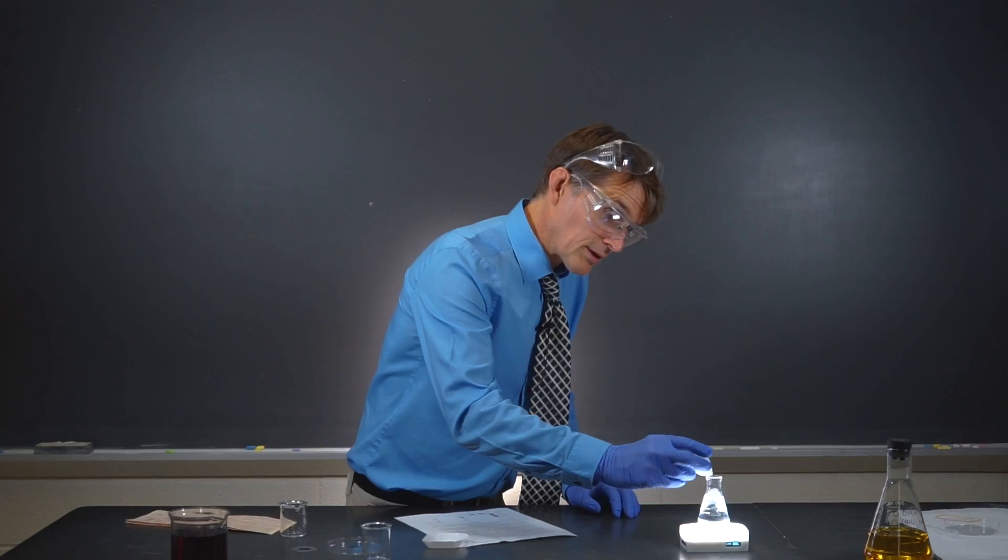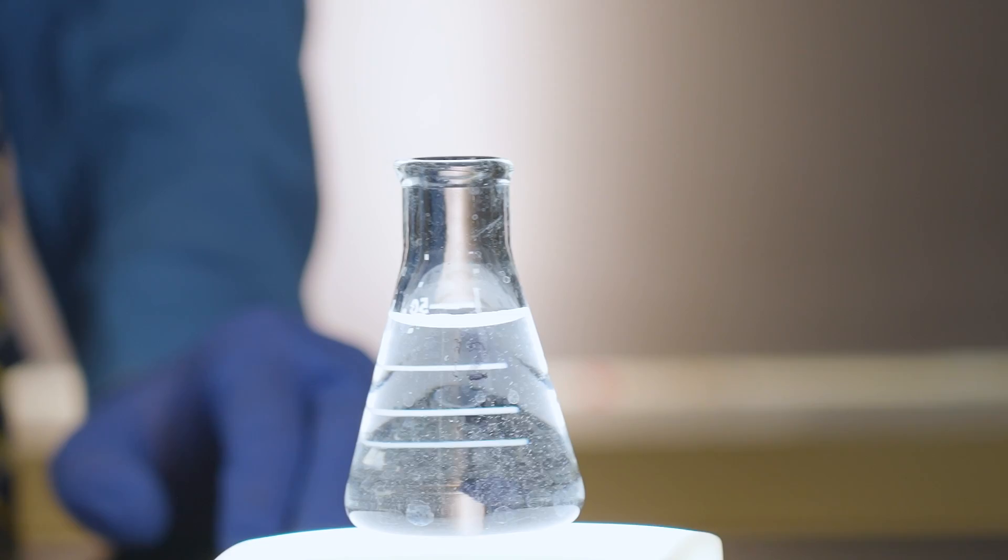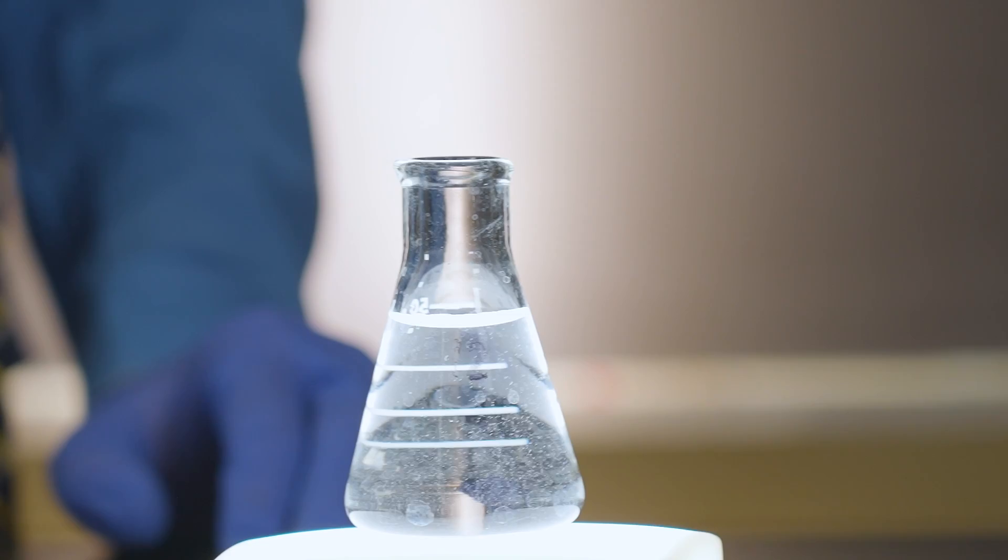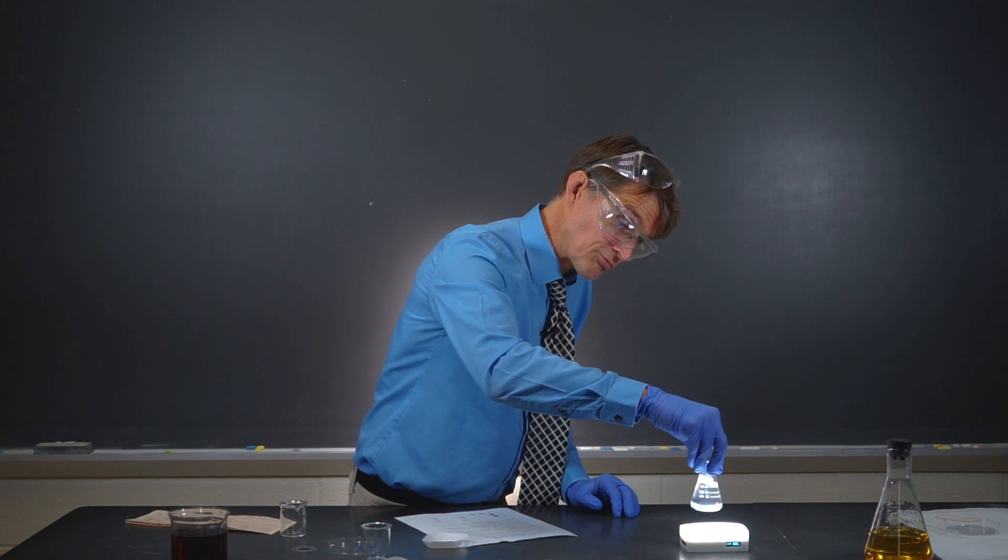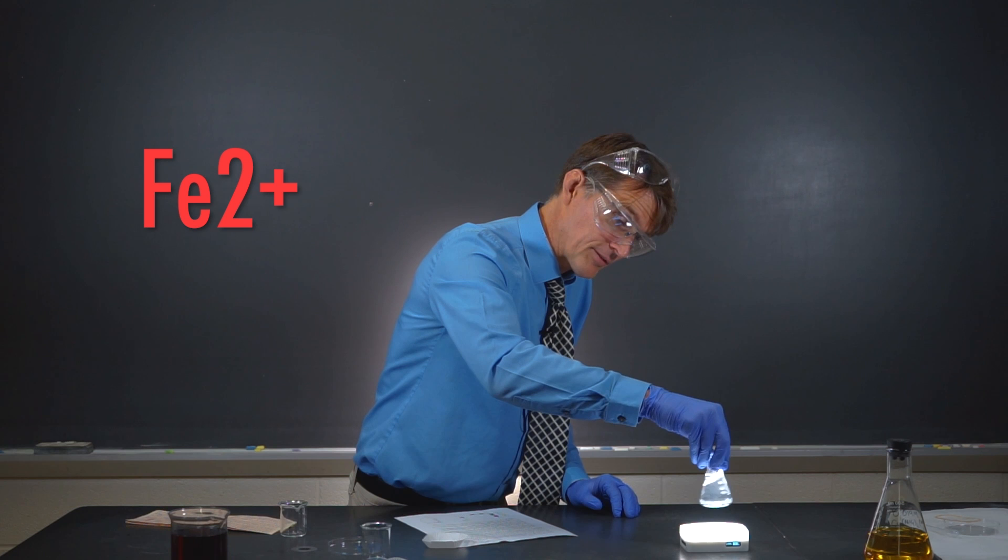We're going to add a little bit of iron ions to this flask here. We're going to try to make our iron indicator. Remember, the iron is what's going to give us the red and the blue color. The iron 2 gives us the red. And if there's iron 3, we're going to see blue.